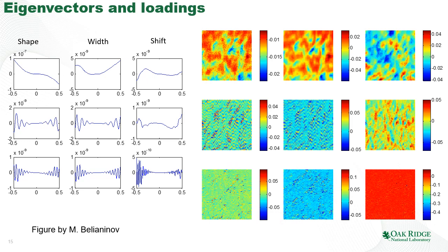They show essentially the noise pattern. In fact, for the last component, component number 9, you can see that it is all concentrated in one spatial pixel. So it's definitely the microscope problem. Maybe somebody entered the lab and slammed the door.